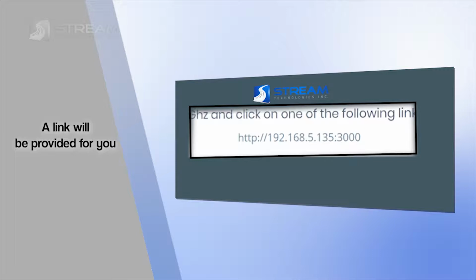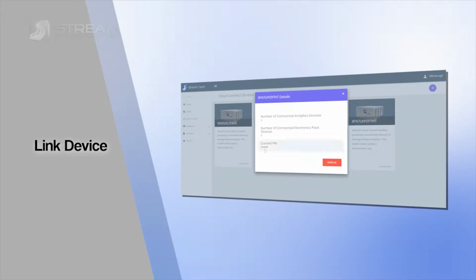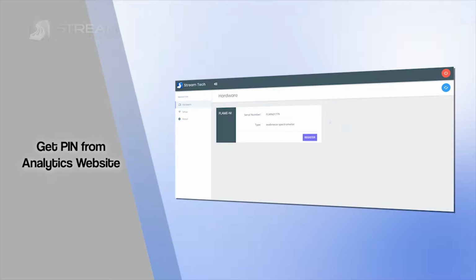And now for every time you want to connect to the lab box, you'll just connect to your regular Wi-Fi network and go from there. Now it wants us to link the device to our Stream account. So we'll go back, and if you remember we had this PIN number in the View Details page. We'll just enter that PIN number to the link screen. So now our lab box, or LabFlow, is connected to our Stream Analytics account.